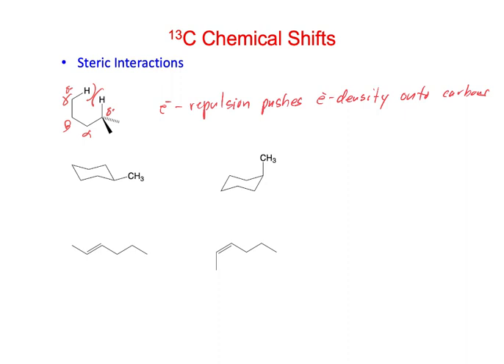If you just have two hydrogens like this, those are small and not really bumping into each other. The more they come around like this, they start to get closer and create a little bit of steric interaction, and then this case is even more, especially if they get held in a position that's pushing those together, right? Oftentimes if they can rotate away, then there might not be a very big population of conformers with them pushing close like that.